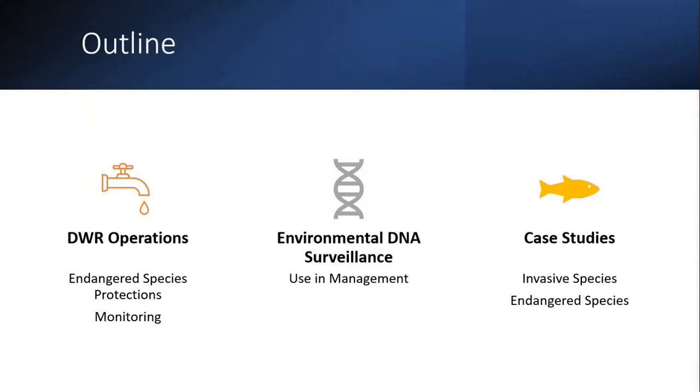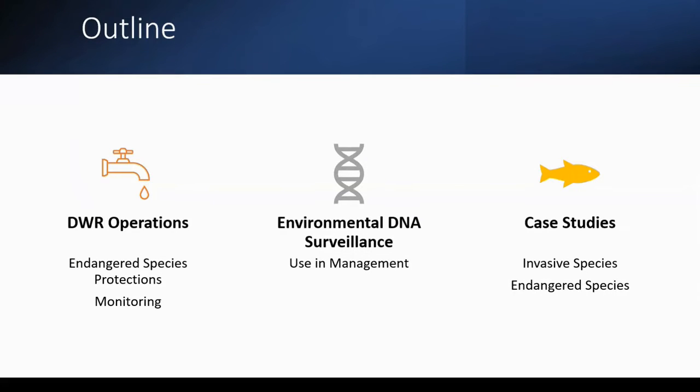And so, just real briefly, the outline here: I'll be talking about DWR operations, so our endangered species protections and monitoring programs, the use of eDNA for species surveillance, and the use and management. And then we'll go into some case studies for using eDNA to monitor invasive species and endangered species.